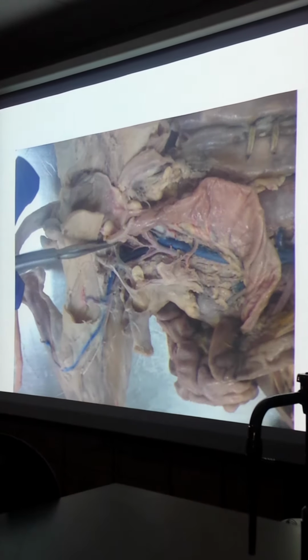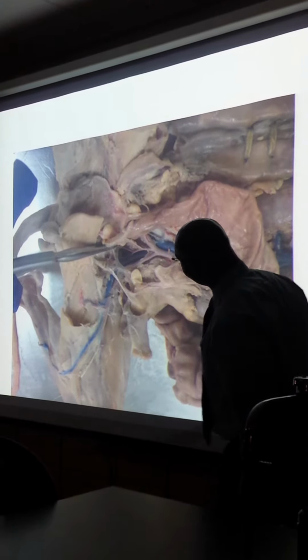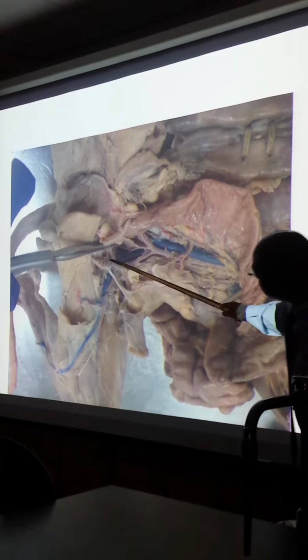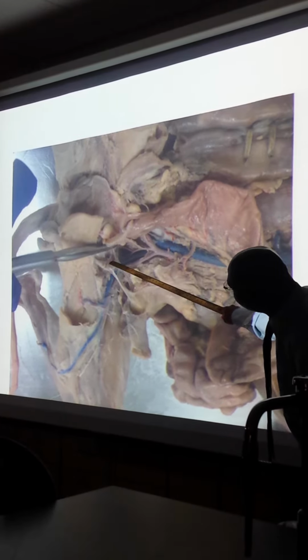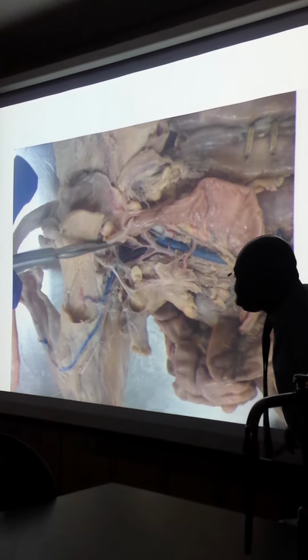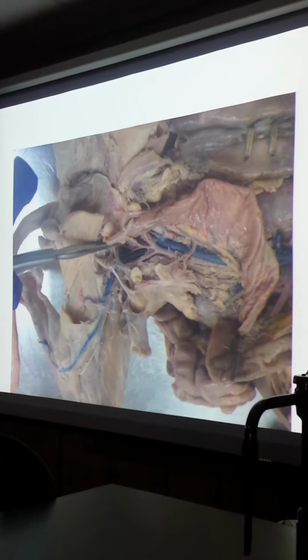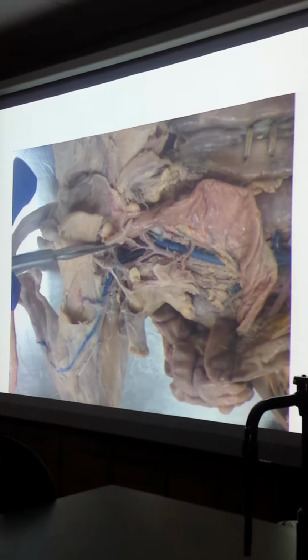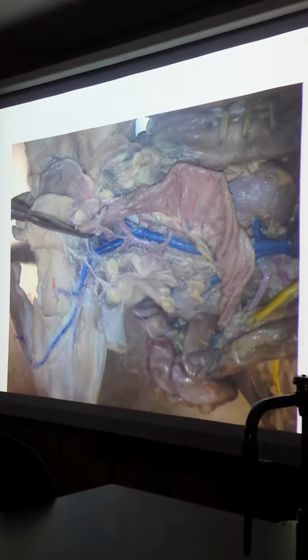And then I have other repeat views. This one is trying to show, of course, the internal iliac vein over here. And I'm going to clean this up so you can see. See this one right here inside here. You see this little red? That's where you get the split for the deep femoral artery and vein. So I'm going to clean that up a little so we can see that properly. And then I'll include those pictures, especially in the final.